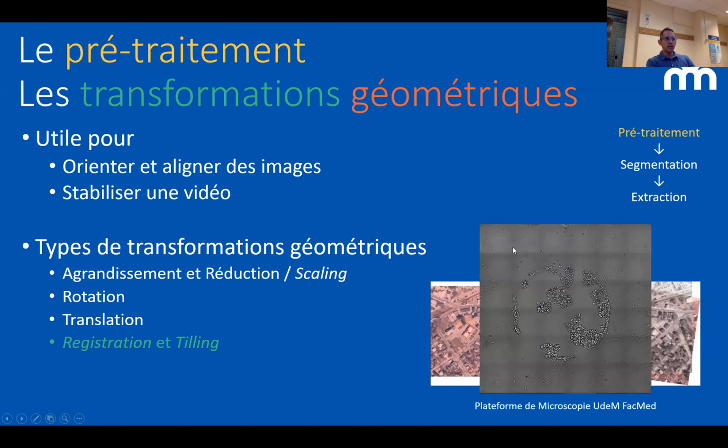The tiling is the one that I showed you before, when you take several images and you stitch them together like little tiles. Here you can see that you have clearly 6 tiles by 6 tiles, and you have this shading that appears. And if you don't want this shading to appear, you have to correct for illumination bias. So registration, tiling, and correction of illumination is important.